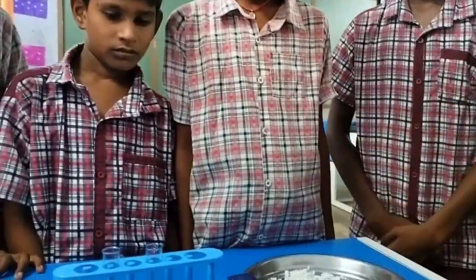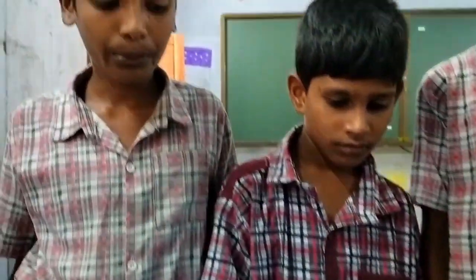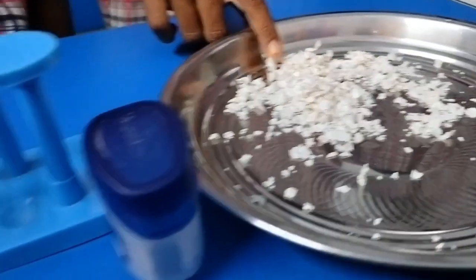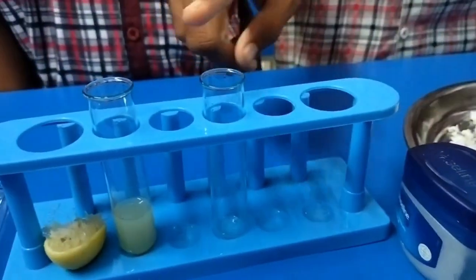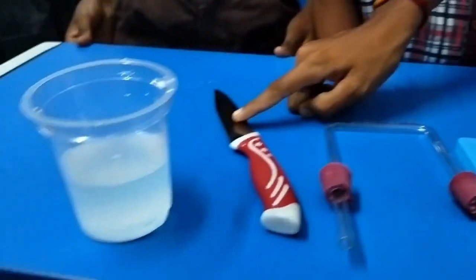Let us observe what will happen if we add eggshells to the lemon juice. Materials required to conduct this activity are eggshells, vaseline, test tubes, U-shaped glass tube, chalk, and lime water.